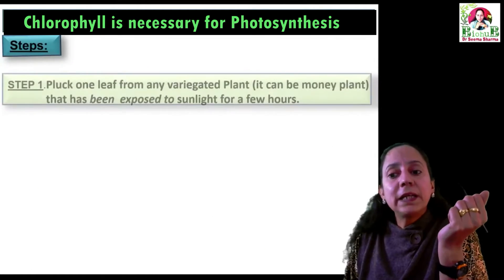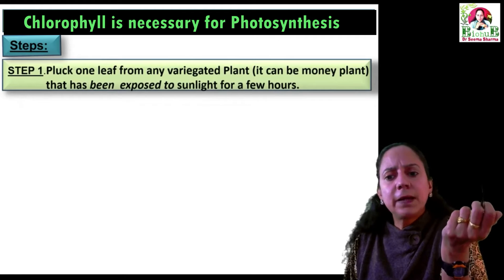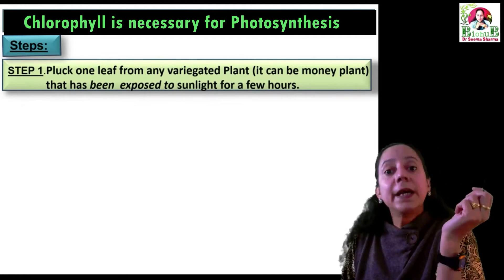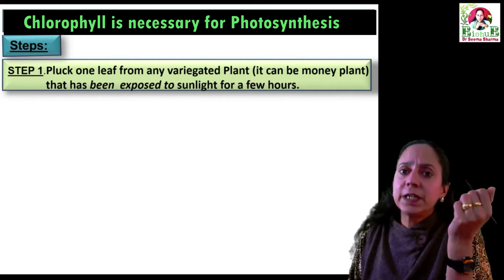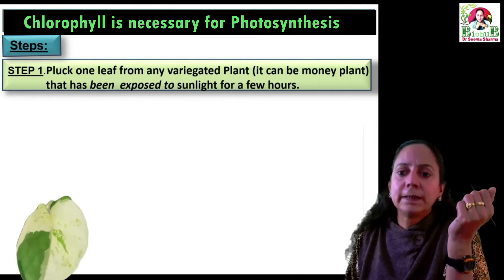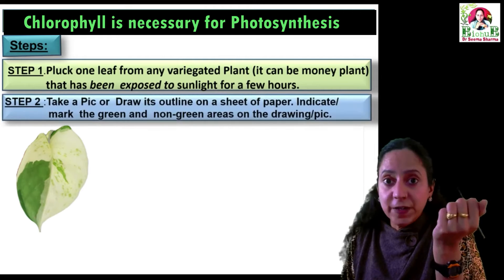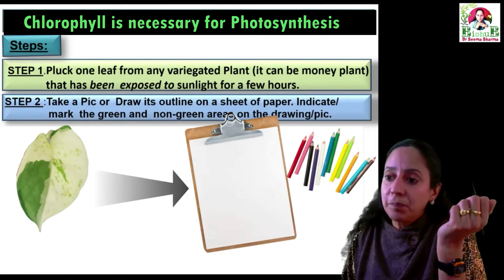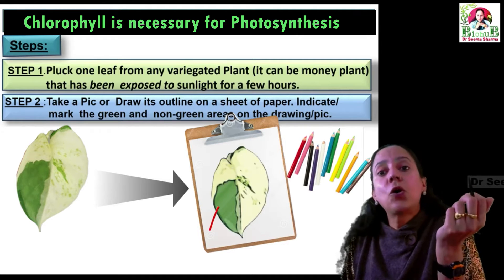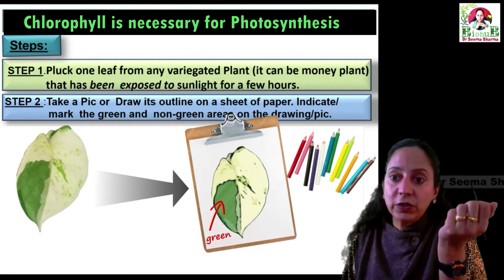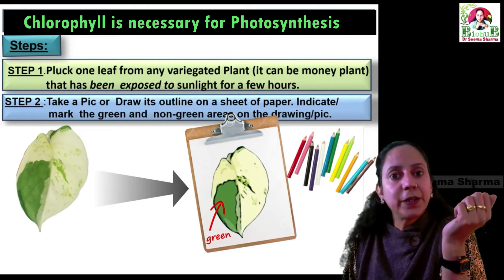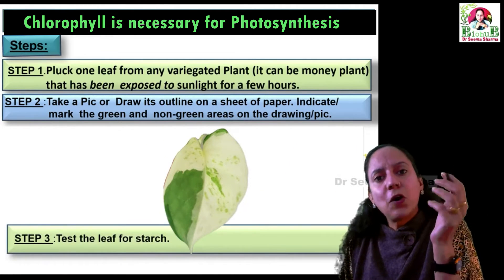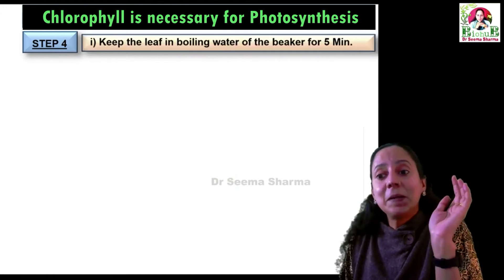Step one: pluck one leaf from any variegated plant that has been exposed to sunlight for a few hours. In this activity we have taken a variegated leaf of money plant. Step two: take a picture of this variegated leaf or draw its outline on a sheet of paper, and indicate or mark the green and non-green areas on the drawing or picture as shown.